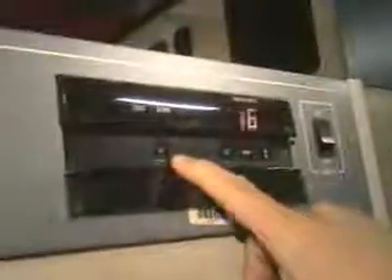Temperature set point and alarm systems up here. We have it chilling down to two degrees. There is no other output, chart recorder or other such. However, on the right hand side, you'll see a little black circle which corresponds to where an input device can be put in for auxiliary output.